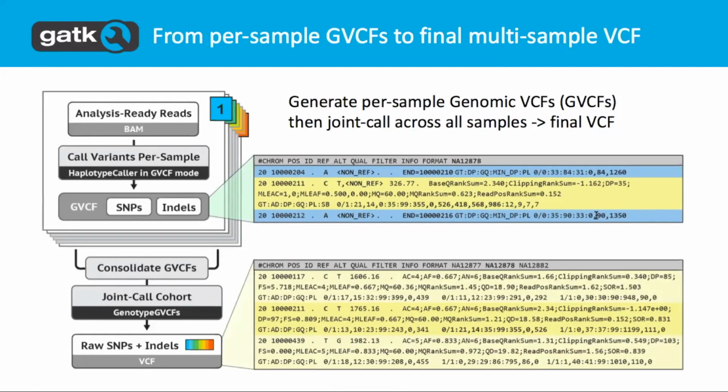Okay, the way it is done in HaplotypeCaller is by having this intermediate output called GVCF, or genomic VCF, where instead of just encoding all the positions where you have variations, you also have all the intermediate positions where you don't actually have a variant, but you still want to have a representation for your confidence of the fact that you don't have a variant there, right?